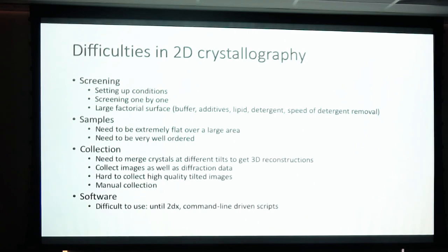You had to do all of that, and it was quite hard and manual. Software also was quite difficult. While 2D was being developed, single particle was also moving along. Once single particle really started to work, once the detectors were up to speed, that was it for the most part for 2D crystallography.